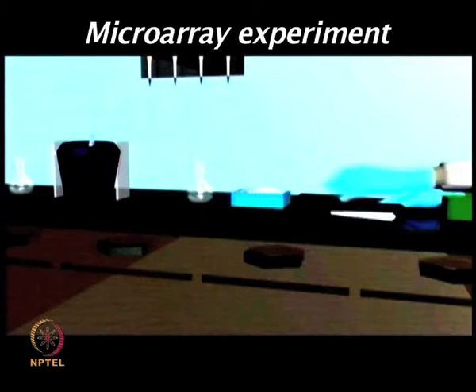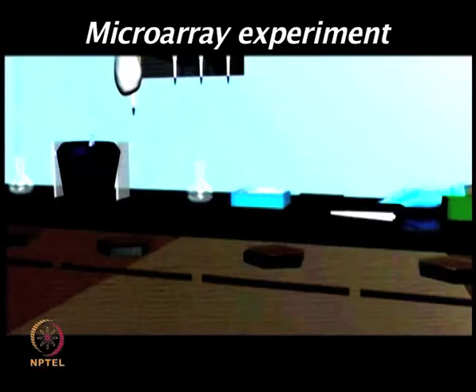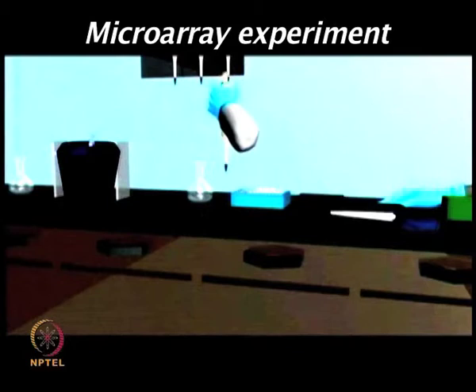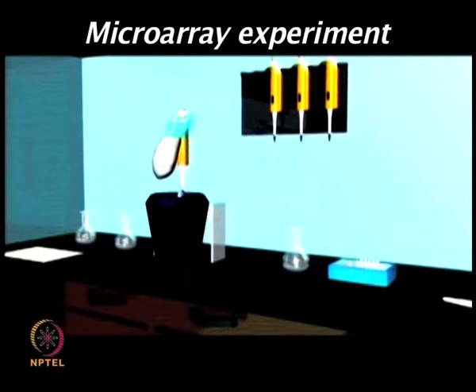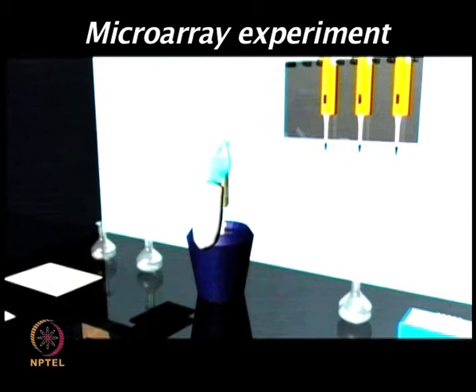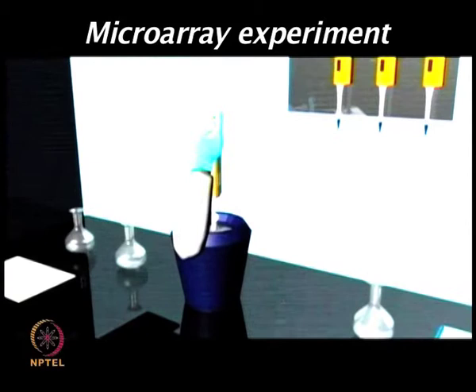Now, after the washing step, apply the secondary antibody, for example anti-human IgG, and again appropriate dilutions can be selected depending upon what dilution works best in your experimental setup. After addition of the secondary antibody, the chip can be incubated for an hour.